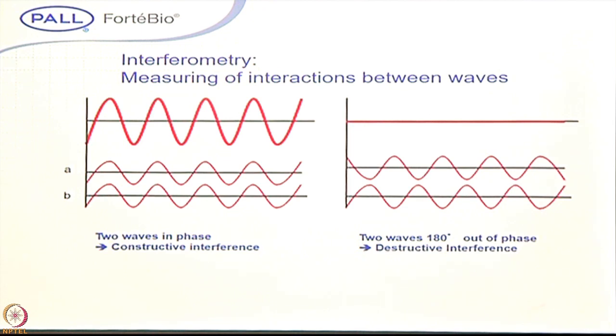And the interference, when it works, the BLI comes, the bio-layer interferometry. The interference pattern makes the signal pattern here. As I mentioned, it works on the wave property. As you know, when the light passes through the fiber optic, there is some kind of a matrix, an obstacle. The forward wave hits that matrix and gets reversed back. So this is the forward wave, this is the reverse wave.